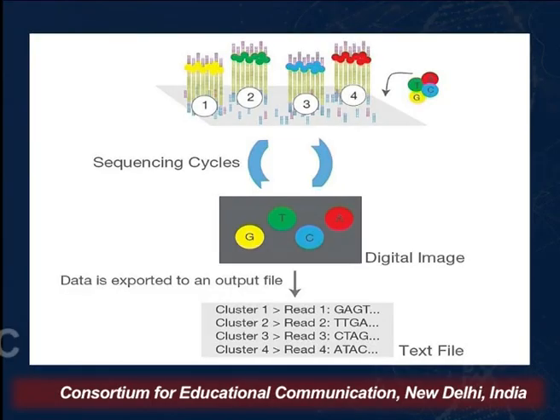So for example, this is showing one of the steps when you add all four nucleotides: on certain fragments, whatever the complementarity is, that fluorophore will be added and then the image will be there. You can see there is an image of a green, a black, a yellow, a blue and a red one. So this way, one nucleotide has been read.